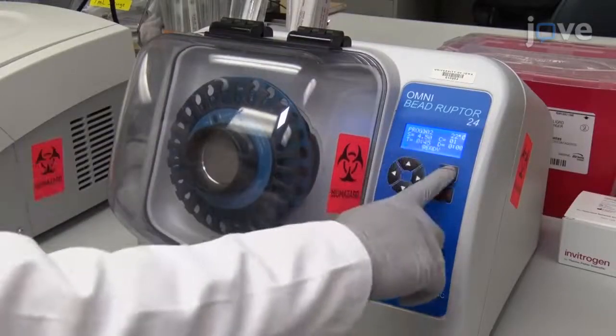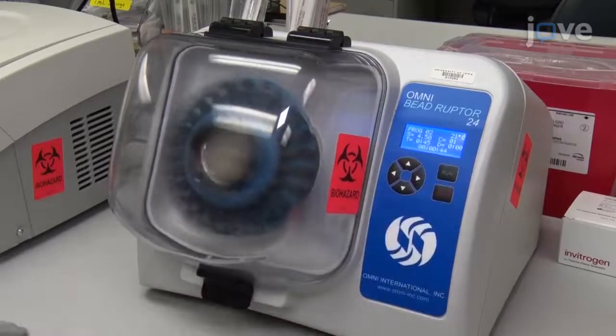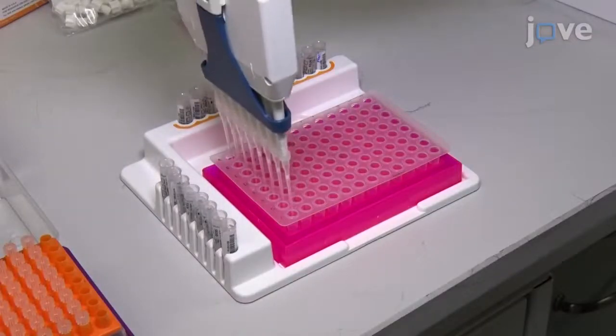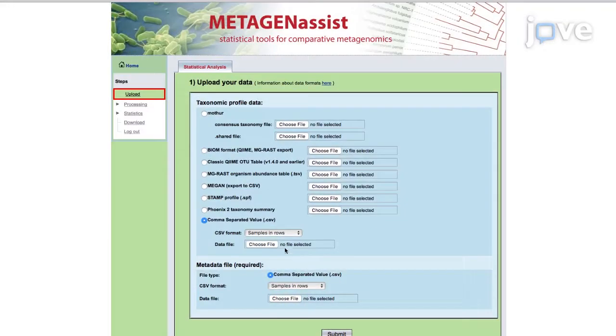Profiling of microbiome is the first step toward defining the role of microbiome in health and diseases. Here, we are describing a simple procedure for isolating high-quality bacterial DNA from fecal sample, preparing library, performing 16S rRNA metagenomic sequencing, and microbiome data analysis. This protocol will help researchers new to the microbiome field, as well as researchers already working in it, in establishing the microbiome pipeline in their lab.